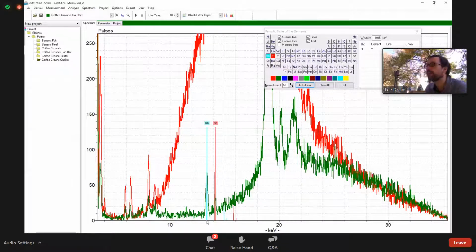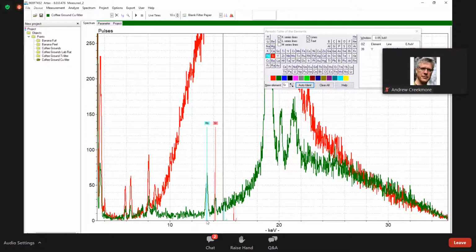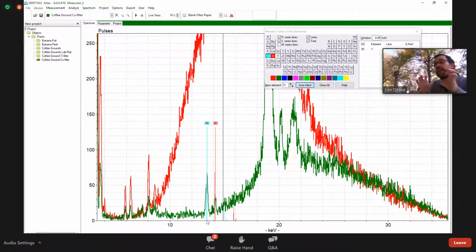Other XRF specialists might disagree with me, but I say this having built probably hundreds, possibly even a little over 1,000 calibrations. The danger here isn't accuracy. I might get a very good R-squared or a high-performing calibration if I use Compton. The problem is generalizability. How do I handle unknown examples when I'm out in the field analyzing? That's really where I run into difficulties, and Compton is just much more sensitive to those changes than Rayleigh is. I can't go into a lot of detail about this because I've got a lot of NDAs with mining companies.